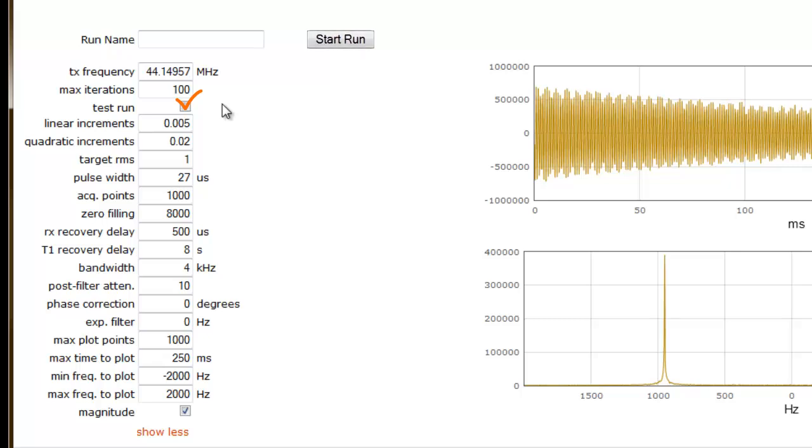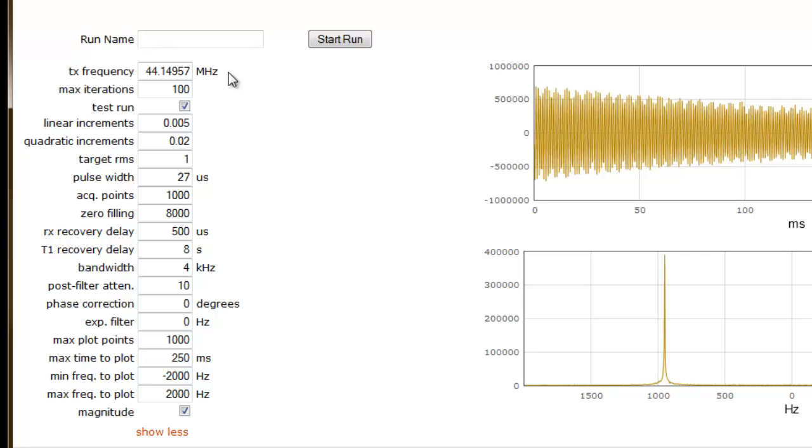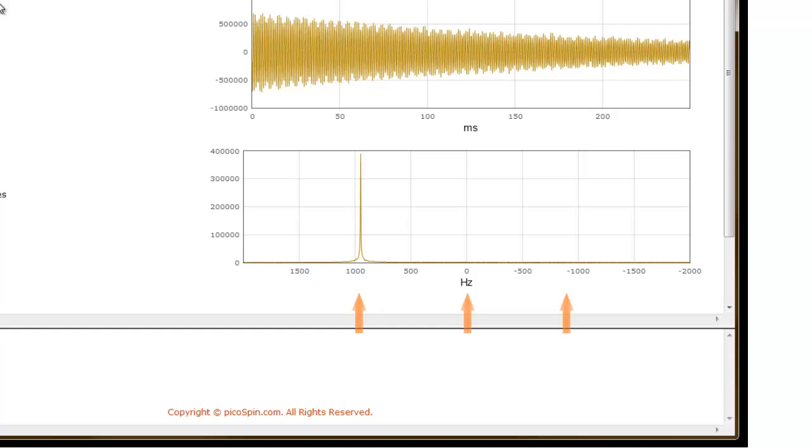Now execute the AutoShim script by clicking on the Start Run button. What this will do is give us an FID and a spectrum plot to look at. Now let's take a look at some of the parameters we'll need to consider for shimming. The transmit frequency is the excitation energy used to excite our nuclei. By adjusting this frequency, we can reposition our signal to the left or right of the center frequency in the spectrum window.